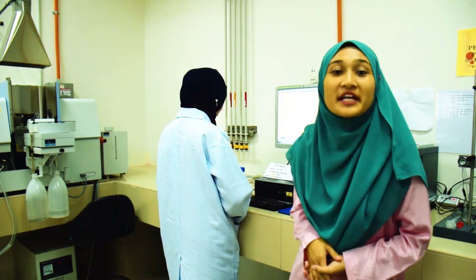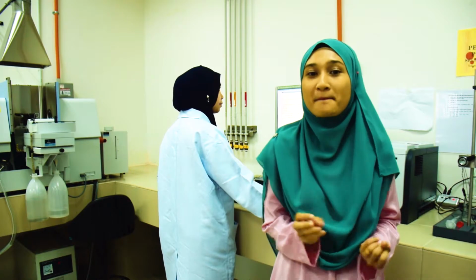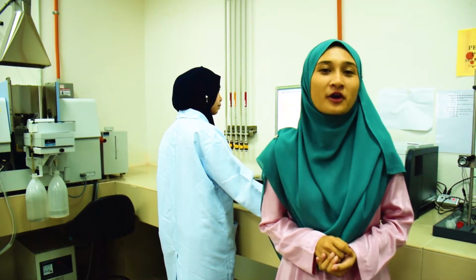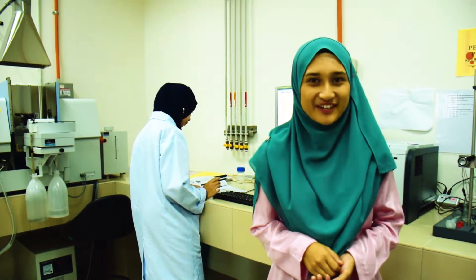HPLC separates, identifies and quantifies components in a mixture by pumping a sample mixture in mobile phase at high pressure through a column with chromatography packing material, which is the stationary phase.